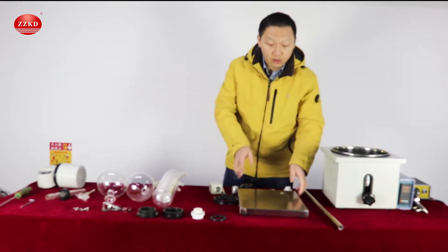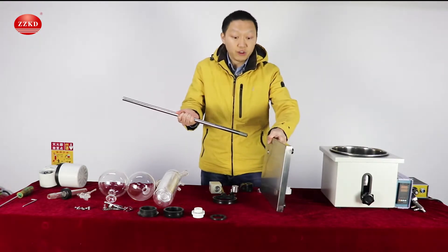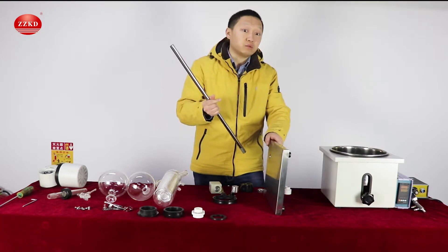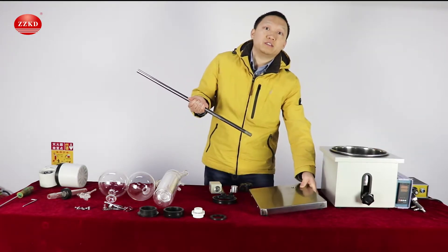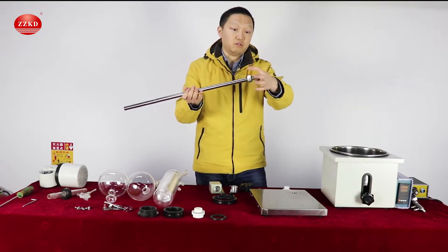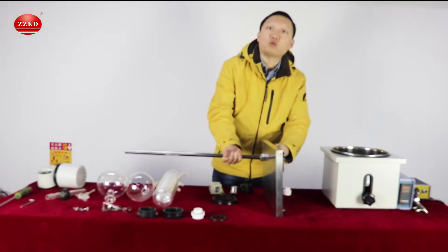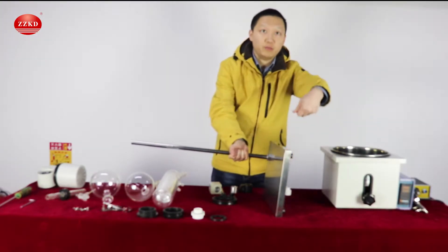First we will start from this base. This is one standing rod, and when you put them together I suggest you use one big wrench, because with a wrench you can fasten it more tightly. We use these two nuts — one on this end, the other on the other end of the base. This is quite simple, but if you want it faster and tighter, use a bigger wrench.